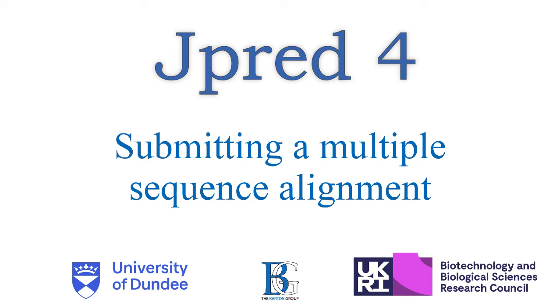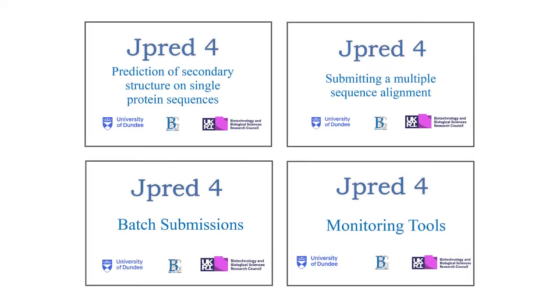This video demonstrates how to use JPRED 4 in multiple sequence alignment mode. It is part of a set of JPRED 4 training videos. The previous video explains how to run JPRED 4 in single sequence mode.